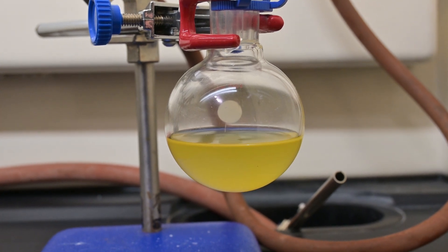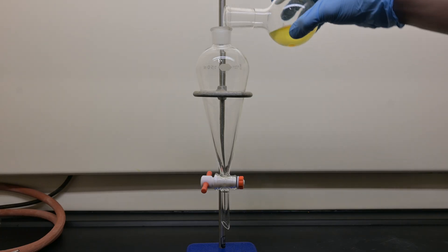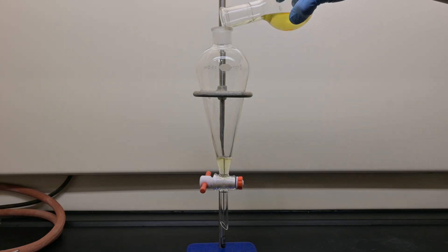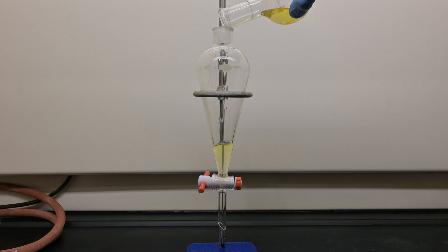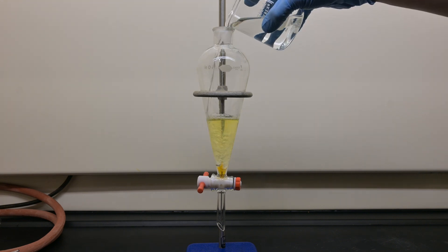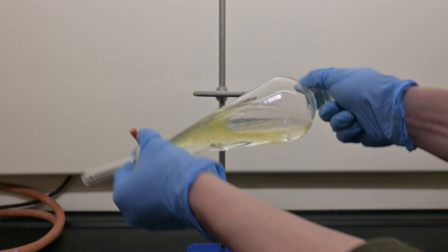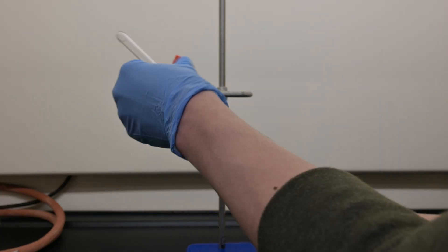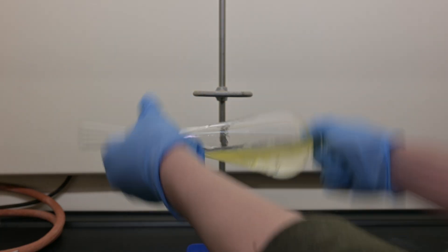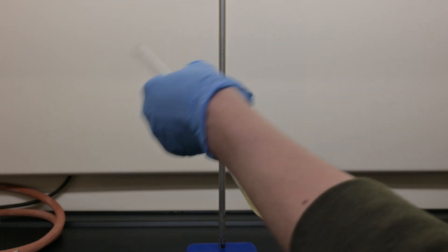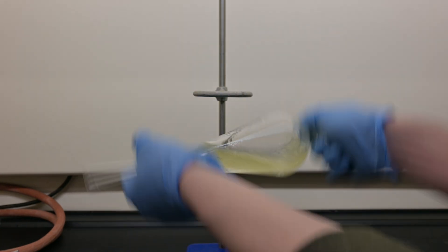Styrene is not water-soluble, but acrylonitrile is. By transferring the distillate to a separatory funnel, then washing the distillate with water, we can remove the acrylonitrile and any other water-soluble impurities. Our non-polar styrene is immiscible with water and will just float on the surface.